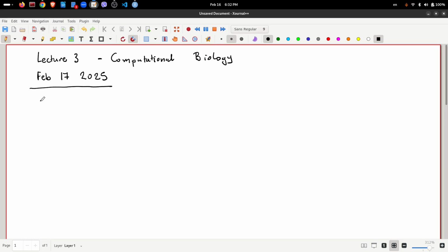So in the previous two lectures we said a few things about next generation sequencing, and we had a very short introduction to Galaxy. Now we will continue with Galaxy, and we will proceed to the first steps of the processing of the NGS data.